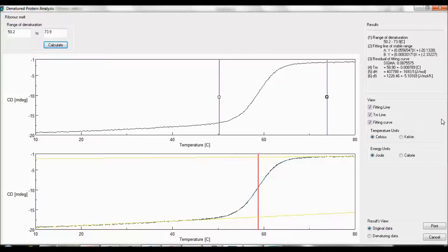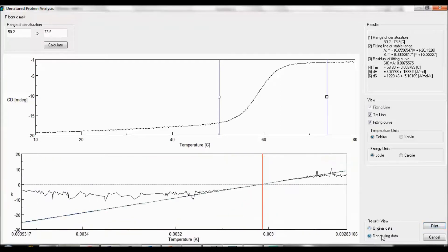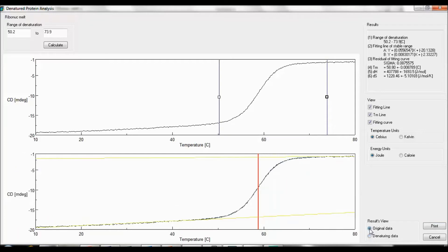You can also choose what units to display your data in for either temperature or energy. Selecting original data plots CD as a function of temperature, while selecting denaturing data shows a Van't Hoff plot where the natural log of the equilibrium constant is plotted as a function of the inverse temperature. You can also choose to print your data by selecting print.